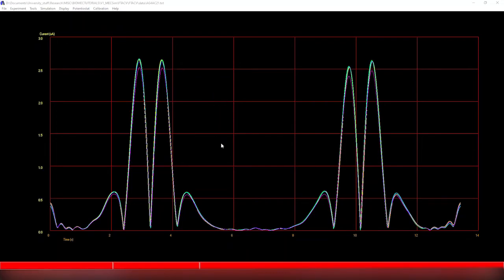It should also be noted that with this data, as we're looking at triplicate experiments, we should take the most middle data when making single point comparisons, so plotting. Because what BIOMEC will do, if presented with multiple sets of data, is take all of them, calculate all the harmonics for every single one of them, and then calculate a mean for all of them. So that would be something more akin to the blue one here.